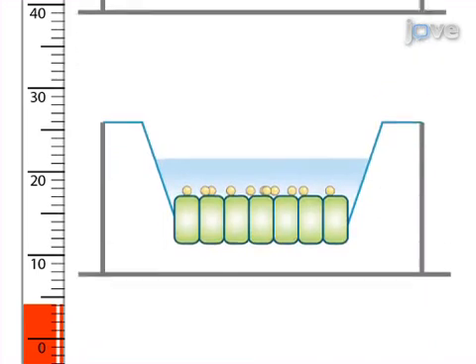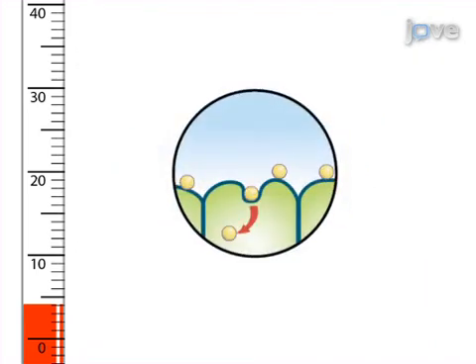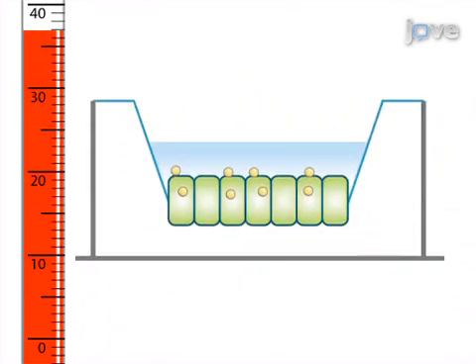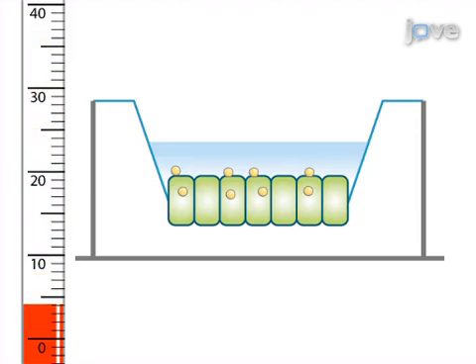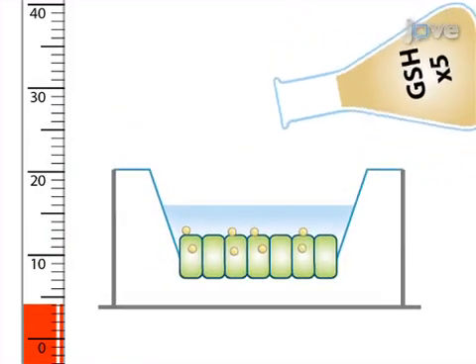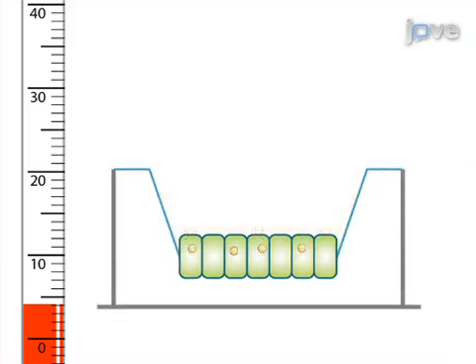The second step is to induce endocytosis of biotinylated plasma membrane proteins by warming the cells to 37 degrees Celsius for specific periods of time. Next, cells are cooled again to 4 degrees Celsius to stop intracellular trafficking, and the biotin is cleaved off with a cell membrane impermeable reducing agent so that the proteins that remain labeled are only those that were endocytosed and thus are protected from the reducing agent.